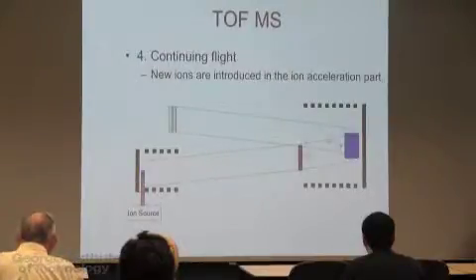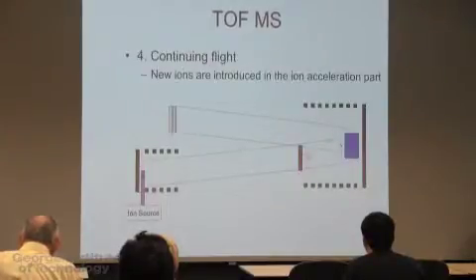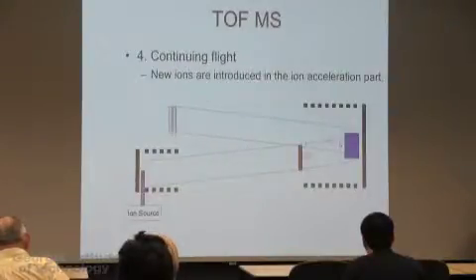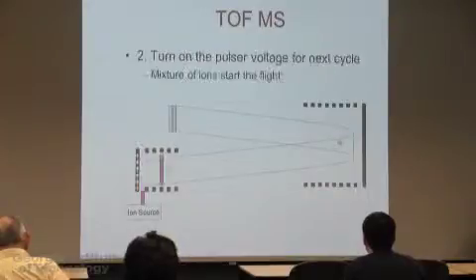So the way that it works is that the instrument basically injects the ions, okay? Injects the ions here, and the ions start separating. So this would be heavy ions, this would be light ions. In particular, this type of instrument uses what's called a mirror or a reflectron, where the ions bounce back and hit the detector. The reason why you need this mirror is to keep the instrument compact. Otherwise, it would make it pretty long. Okay, so this is the time of flight of an ion.